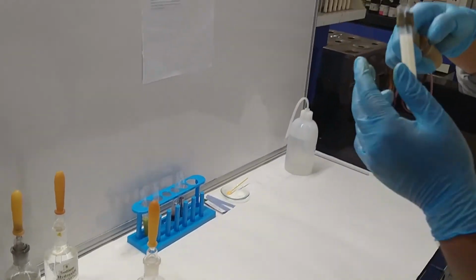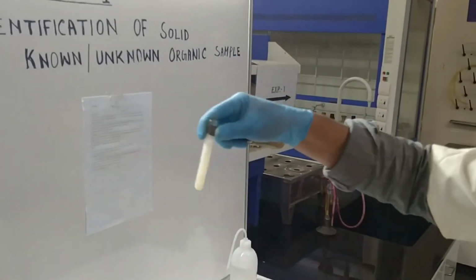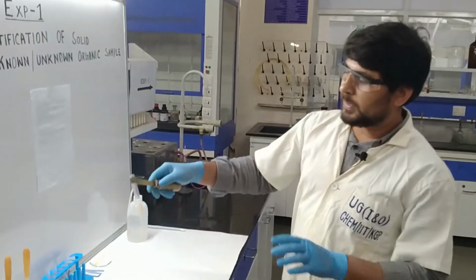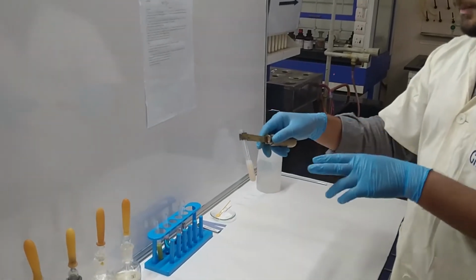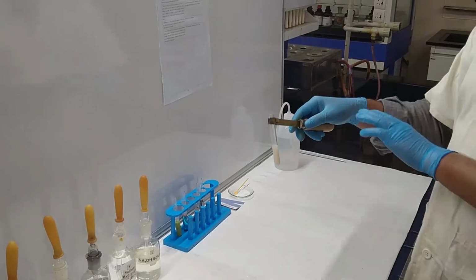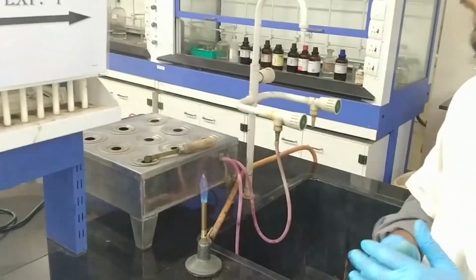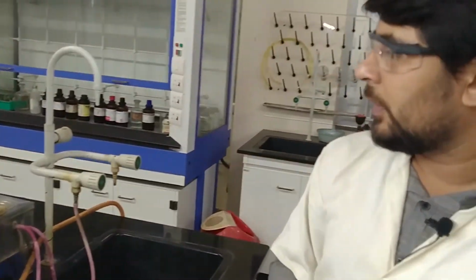So now you can find a white precipitation over here. After getting the white precipitation, once it appears, we have to heat this mixture again. Okay. So just put this one over here in the hot water bath and just wait for a while.